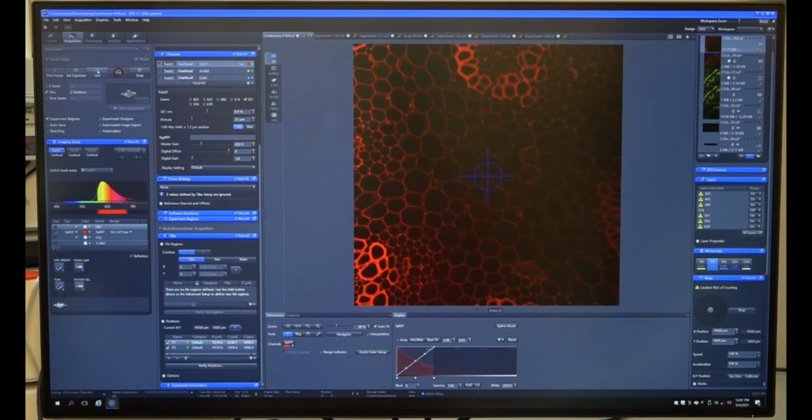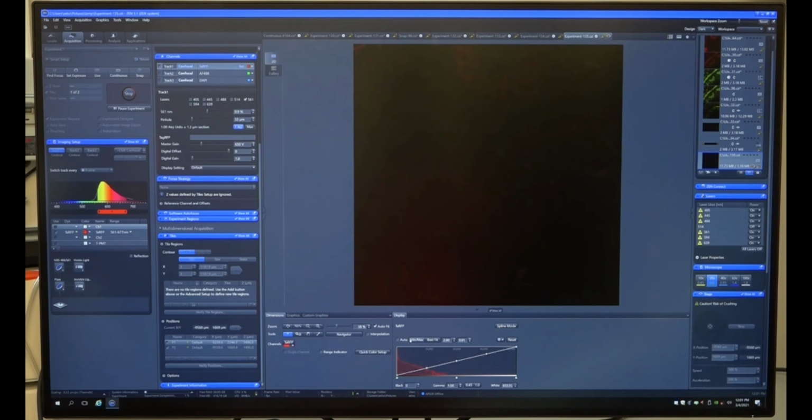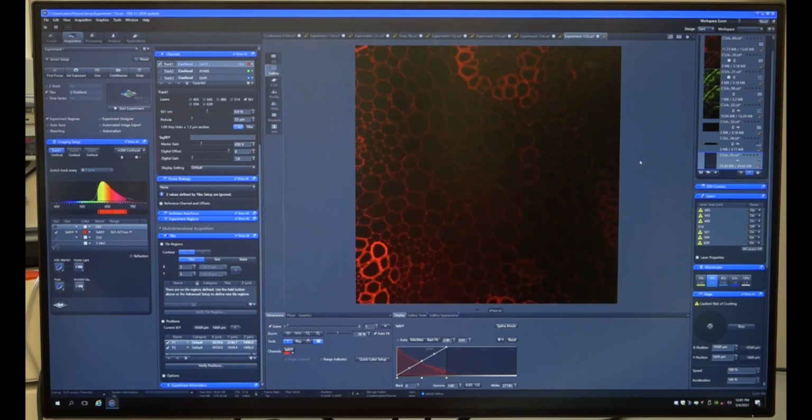So these are 2 different positions which I have marked, and I want to take images from 2 different positions. So I'll just click, and then position A and position B will come. So this is position 1, let us say 2. So here position 1 and position 2, these are different.